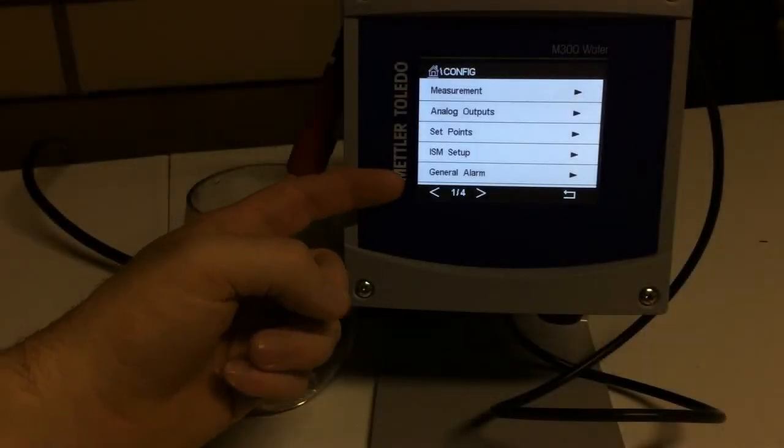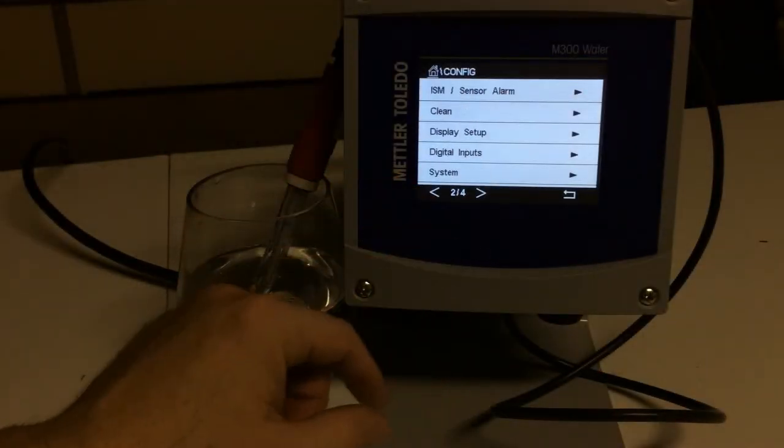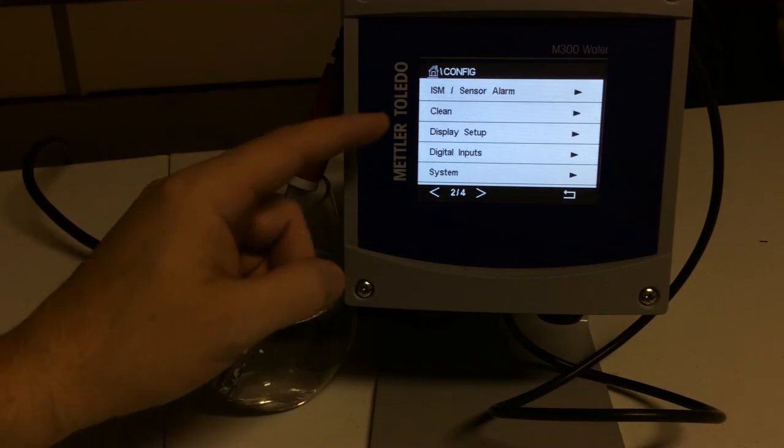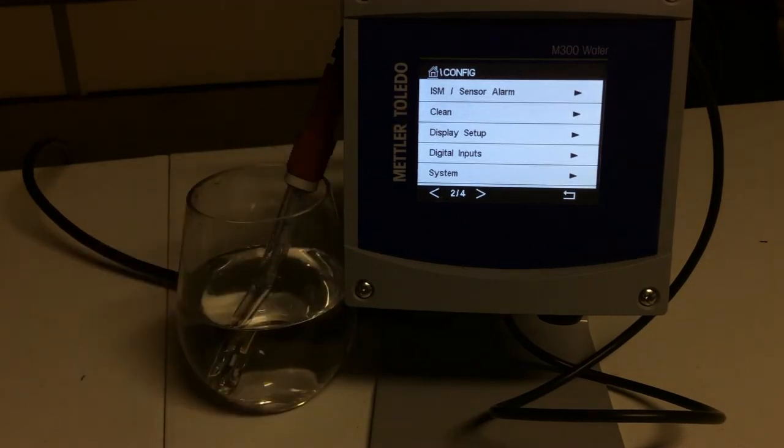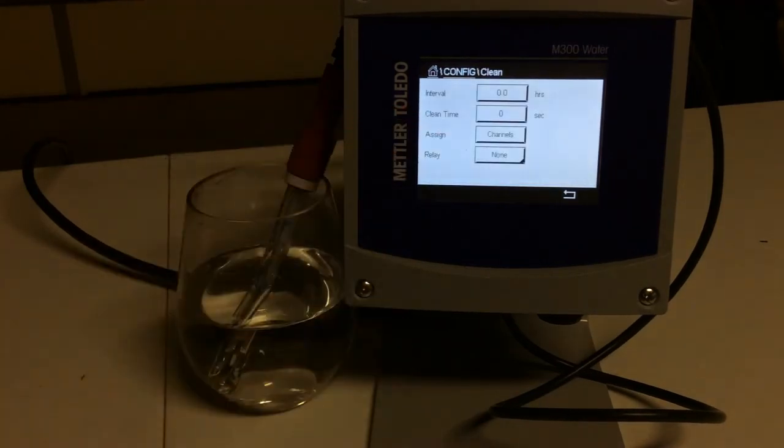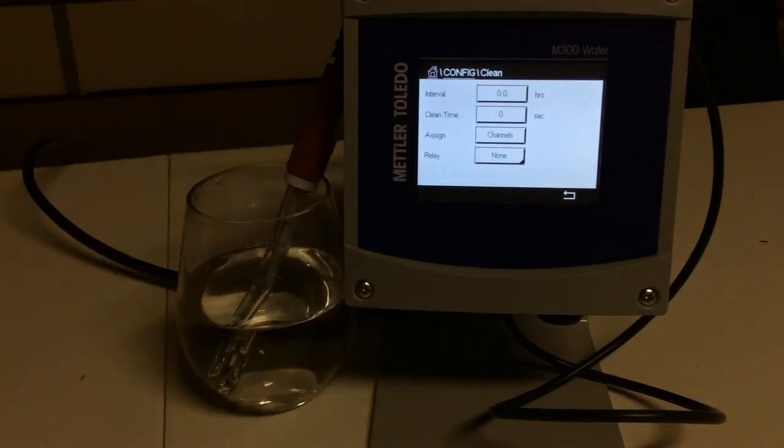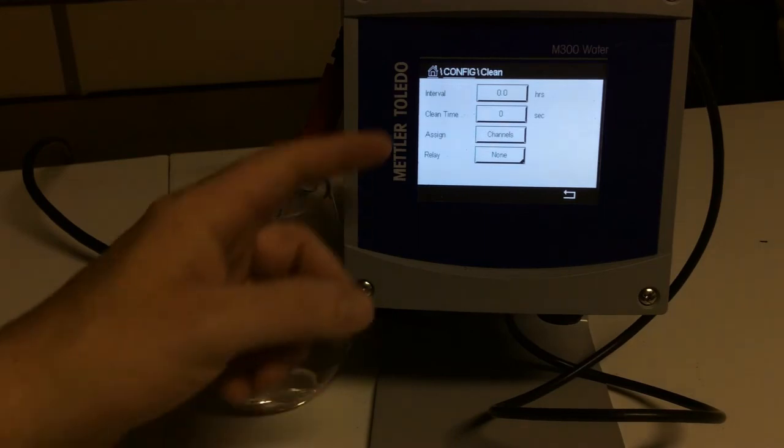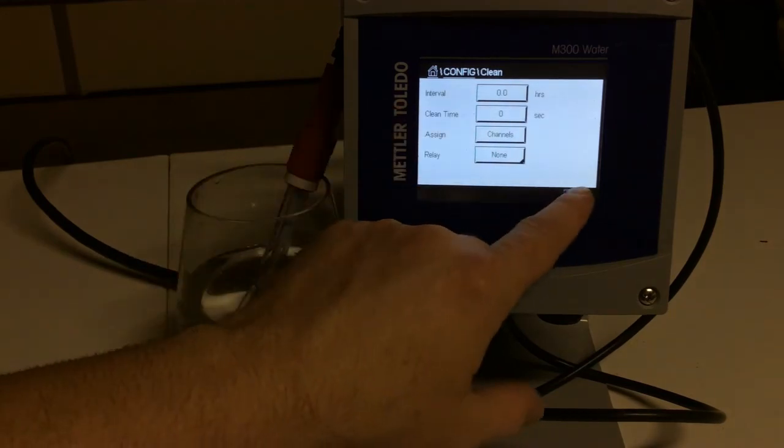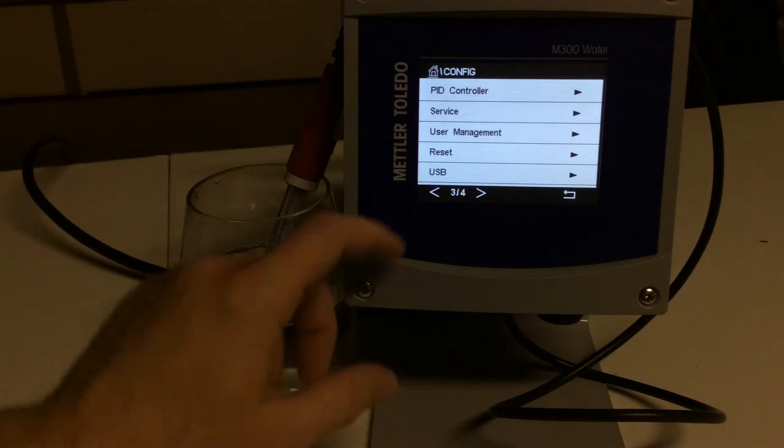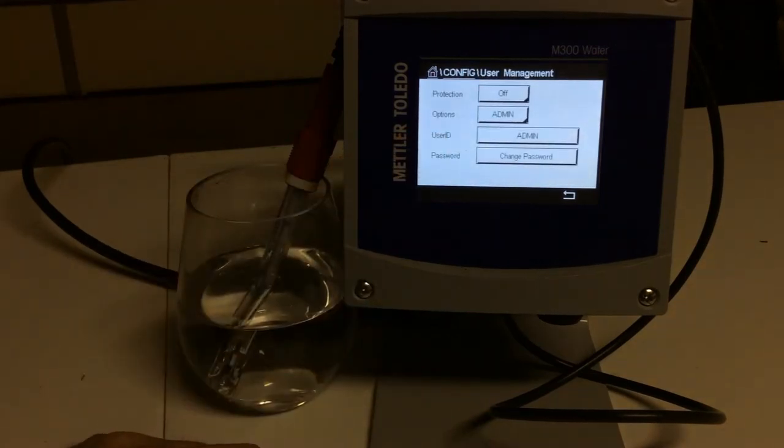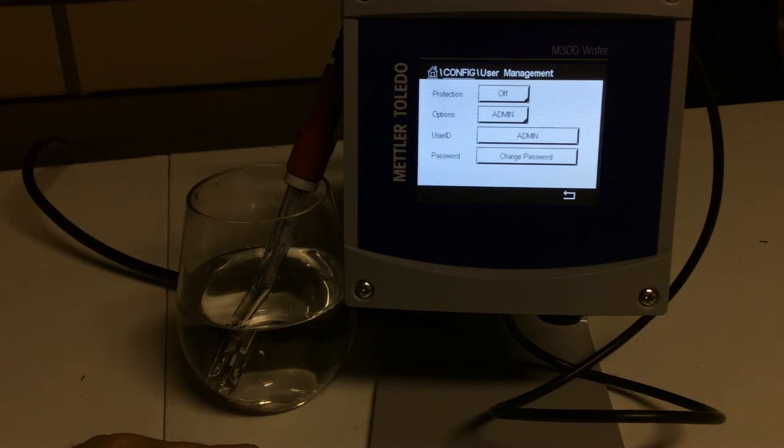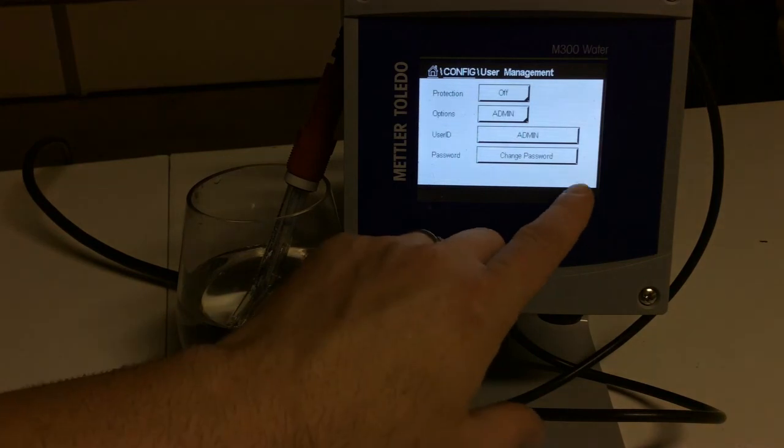So this is also where you can do your alarms. You can do your cleaning. If you have a cleaning system hooked up to this, it would take a special housing, but you can set up in different intervals every four hours, you want to clean for 30 seconds assigned to a certain channel. We can do that. We can also do a user management here. And so this is where you can put a password to keep certain people out or only limit the amount of people who can get in there and make changes. It's really up to you how you want to do that.